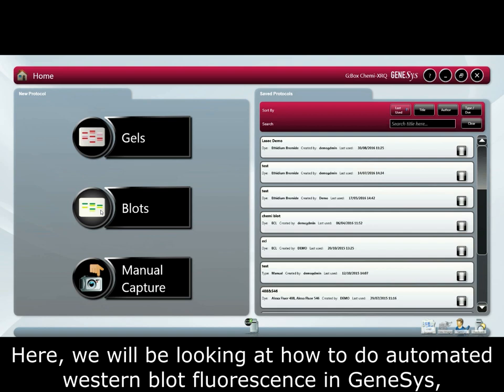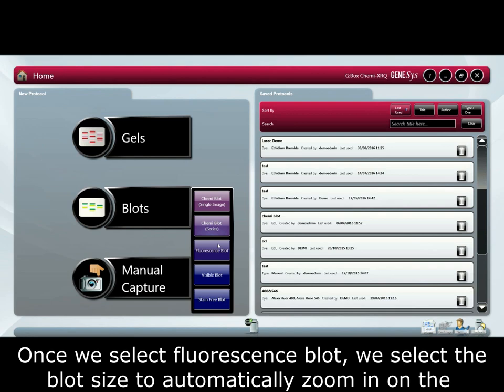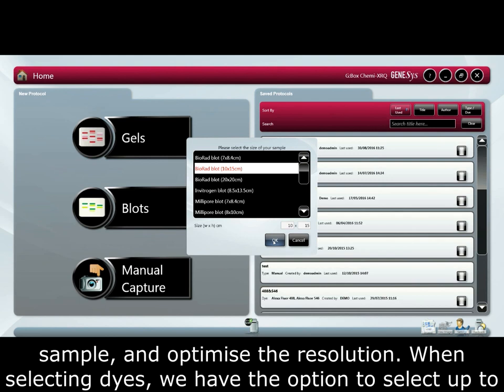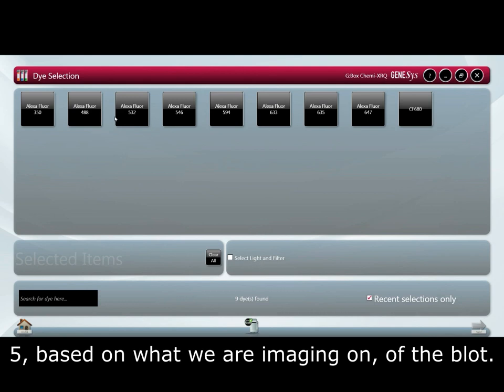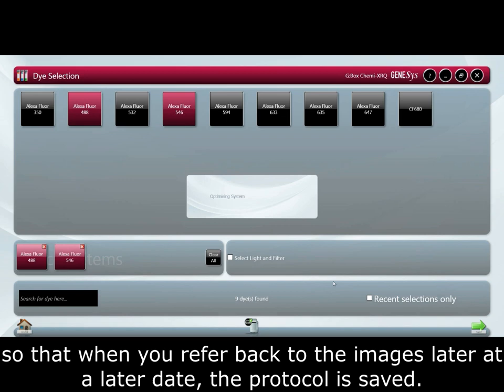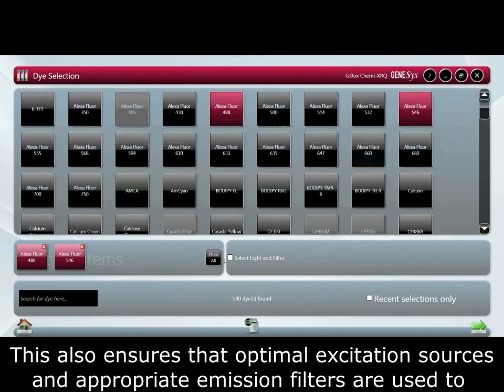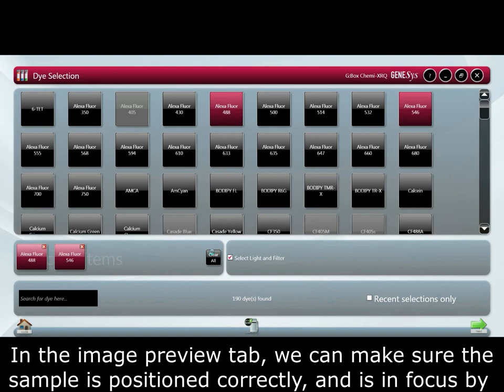Here we will be looking at how to do automated western blot fluorescence in Genesys using two different band passes. Once we select fluorescence blot, we select the blot size to automatically zoom in on the sample and optimize the resolution. When selecting dyes we have the option to select up to five based on what we are imaging on the blot. The fluorophores used on the blot are chosen so that when you refer back to the images at a later date the protocol is saved. This also ensures that optimal excitation sources and appropriate emission filters are used to give you the best possible image.